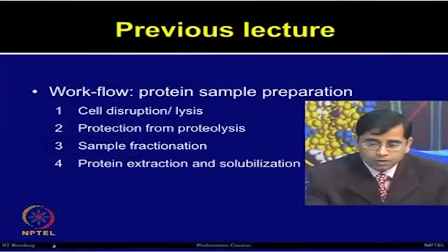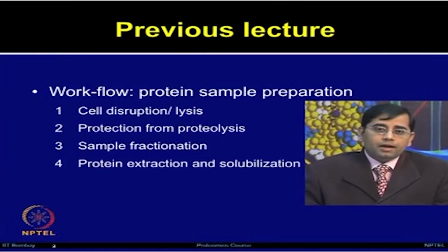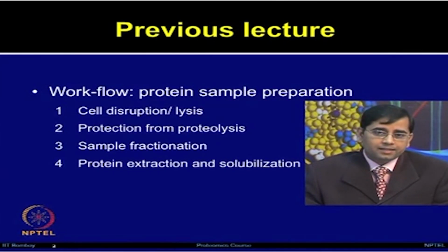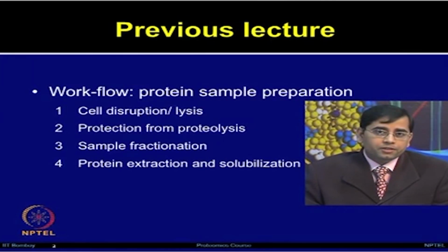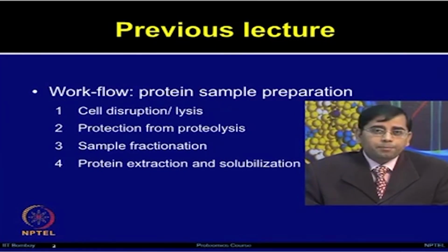So, let us look back at the last lecture. In the previous lecture, I described how to disrupt the cell or lyse the cell. I gave you different methods, how to protect the protein component during the proteolysis, and different types of protease inhibitors were described. The sample pre-fractionation methods were discussed, and then we started talking about protein extraction and solubilization.